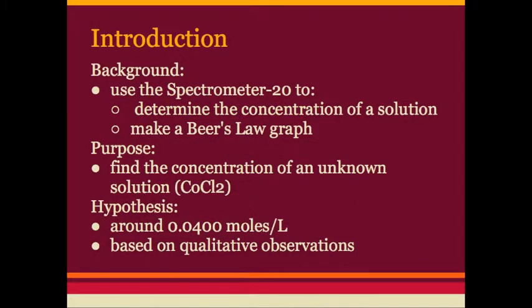The purpose of this lab is to find the concentration of an unknown solution with Beer's law. Beer's law states that the concentration of a solution is proportional to the amount of light absorbed by a solution.